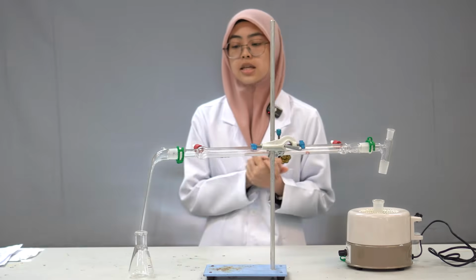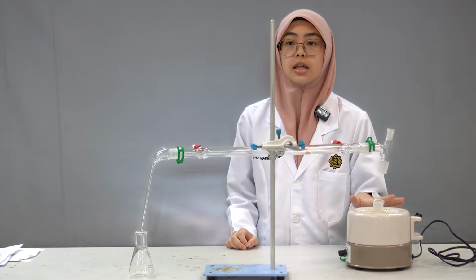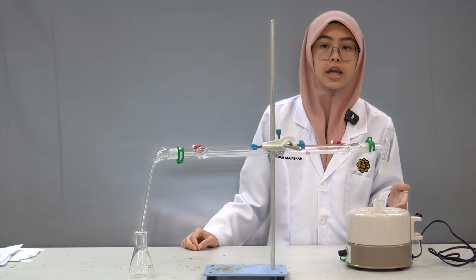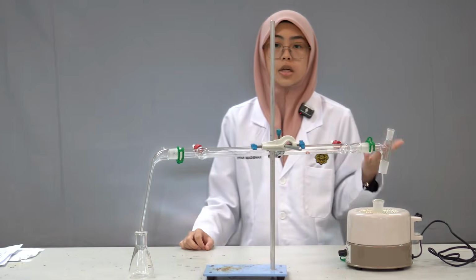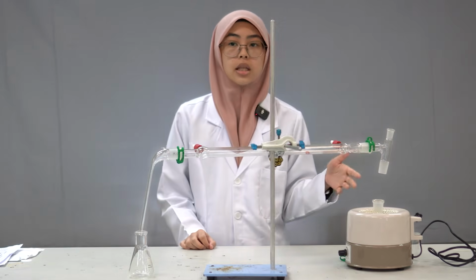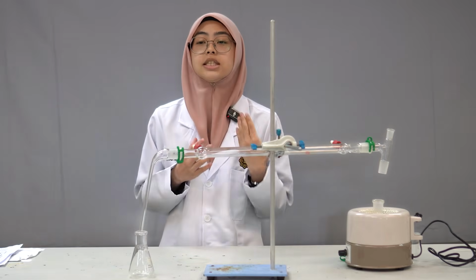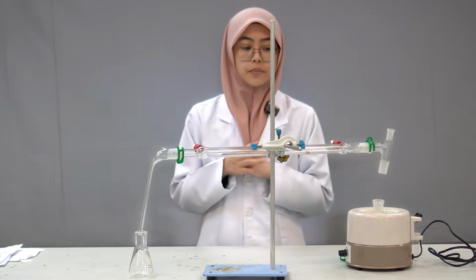Next, in this distillation, we use the heating mantle instead of the Bunsen burner. Why? Because a Bunsen burner is an open flame that will easily ignite the solvent vapors. So we use the heating mantle, as it provides indirect heat and is safer for the flammable solvent.